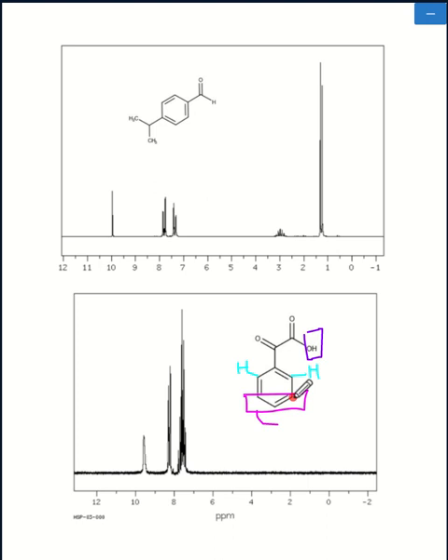So you could label 2 of these carbons as 1 letter and then the bottom carbon as a second letter, or you can use just 1 letter to represent all 3. More or less, whatever you do, you would have that label or those 2 labels for the peak that represents the protons on those 3.